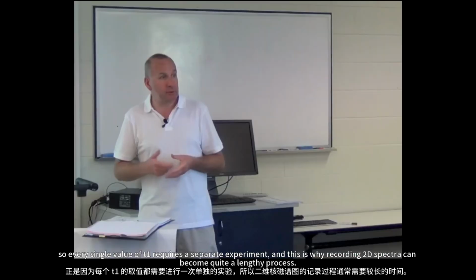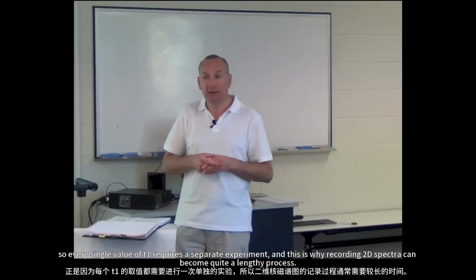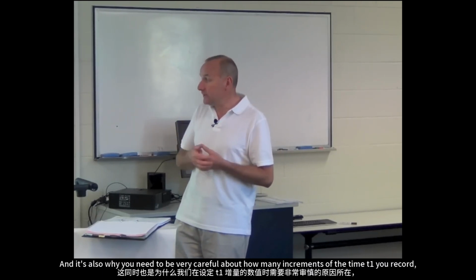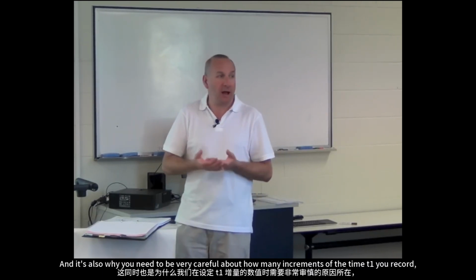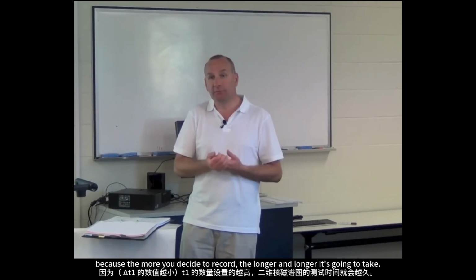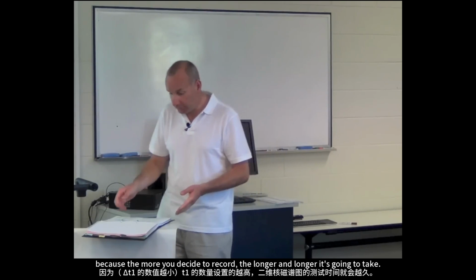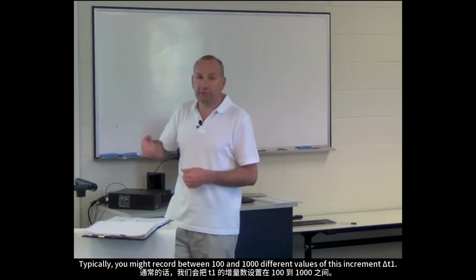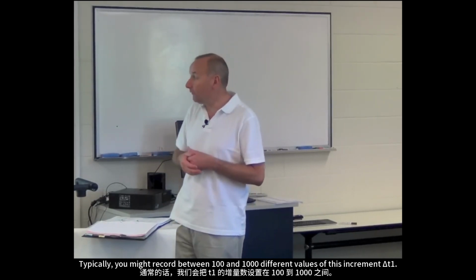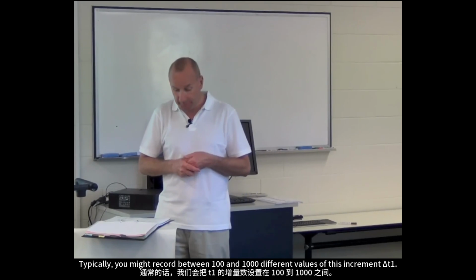And this is why recording two-dimensional spectra can become quite a lengthy process. And it's also why you need to be very careful about how many increments of the time t1 you record, because the more you decide to record, the longer and longer it's going to take. Typically you might record between 100 and 1,000 different values of this increment t1.